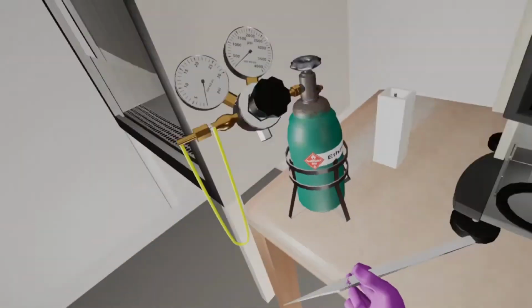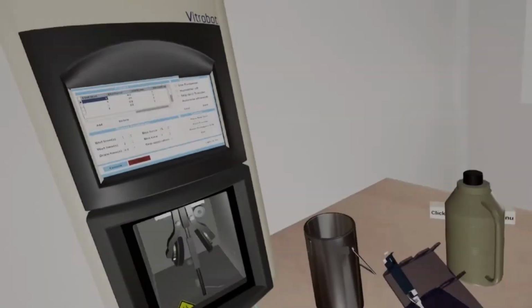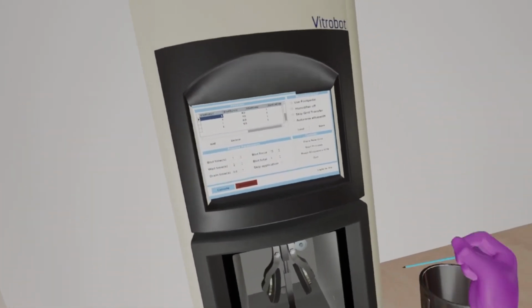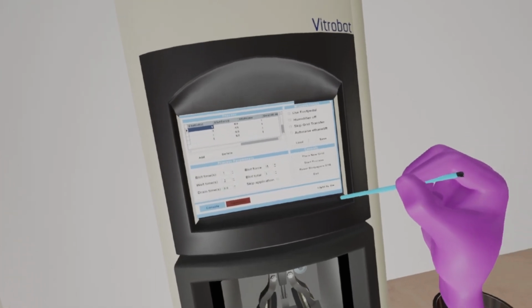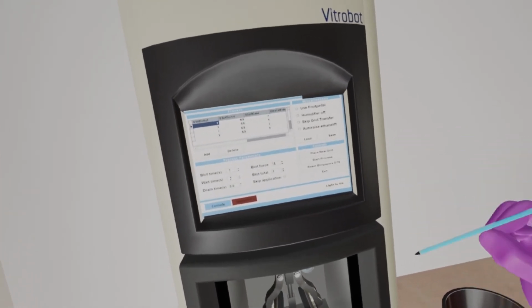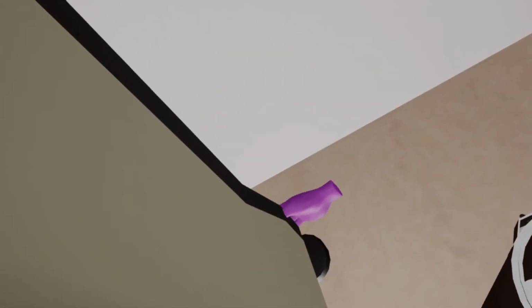Now let's clean the lab. Tap the exit button on the Vitrobot screen. Wait for the Vitrobot to shut down. The screen will go completely blank and black. Flip off the power switch on the back of the Vitrobot.